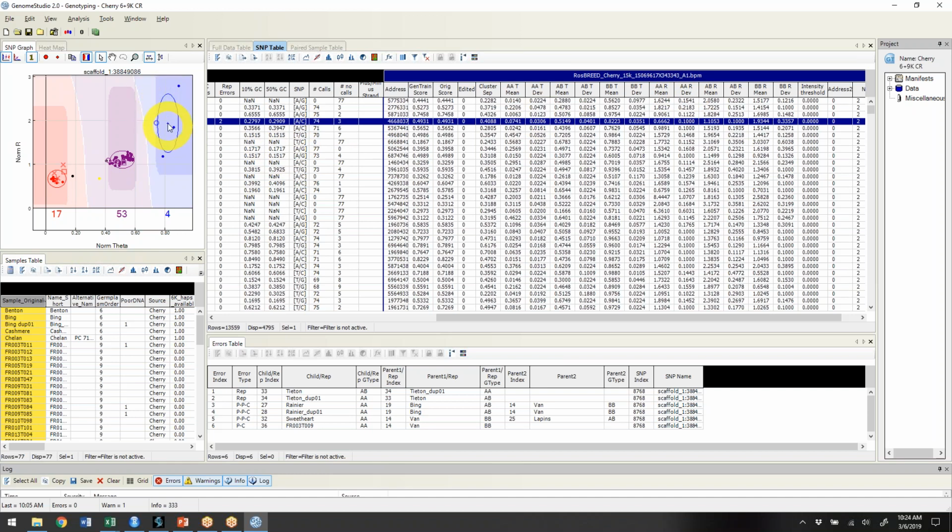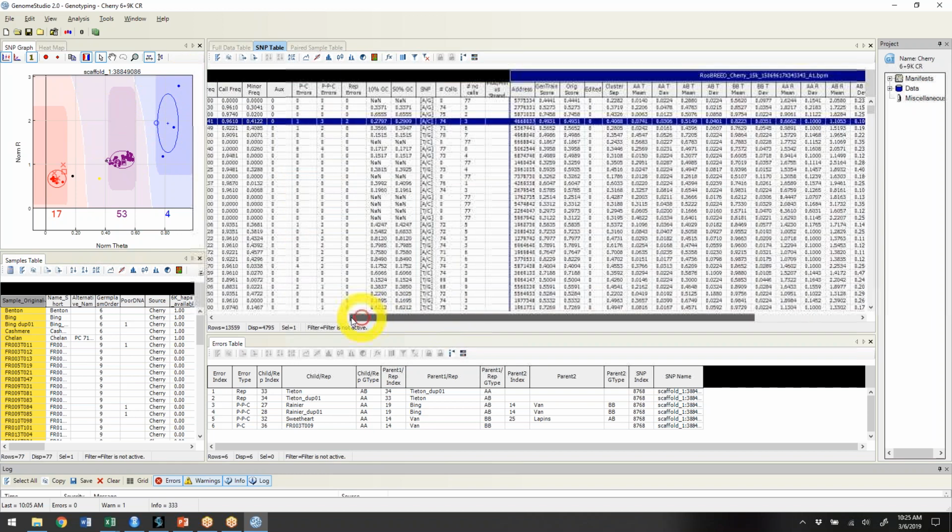So this would be the BB R dev, and along the x-axis, the width along that one would be the BB T dev. That could give you some useful information, because if your cluster is really, really big, or at least the deviation is really big, then that might indicate something is going wrong as well.